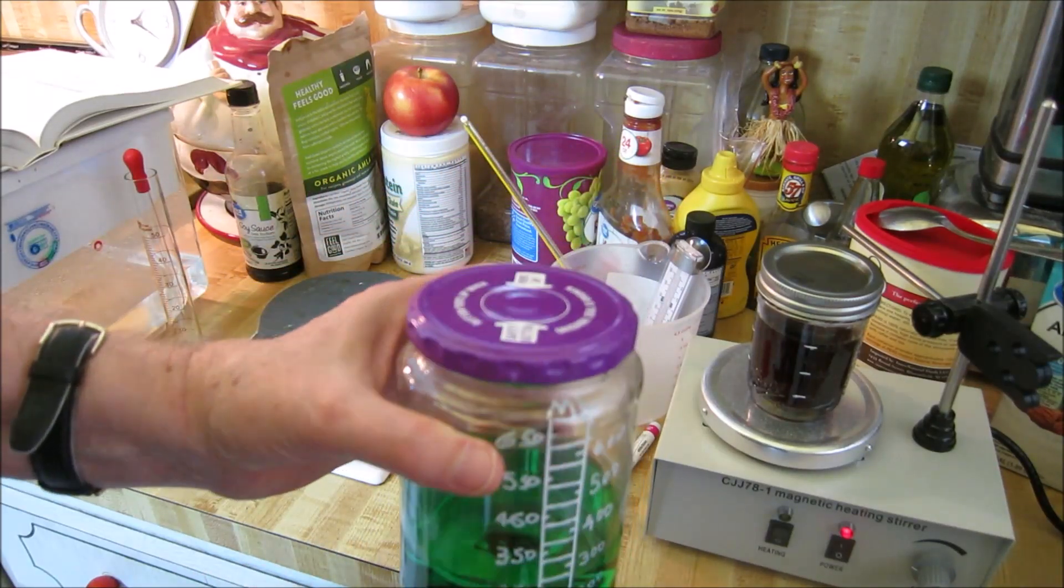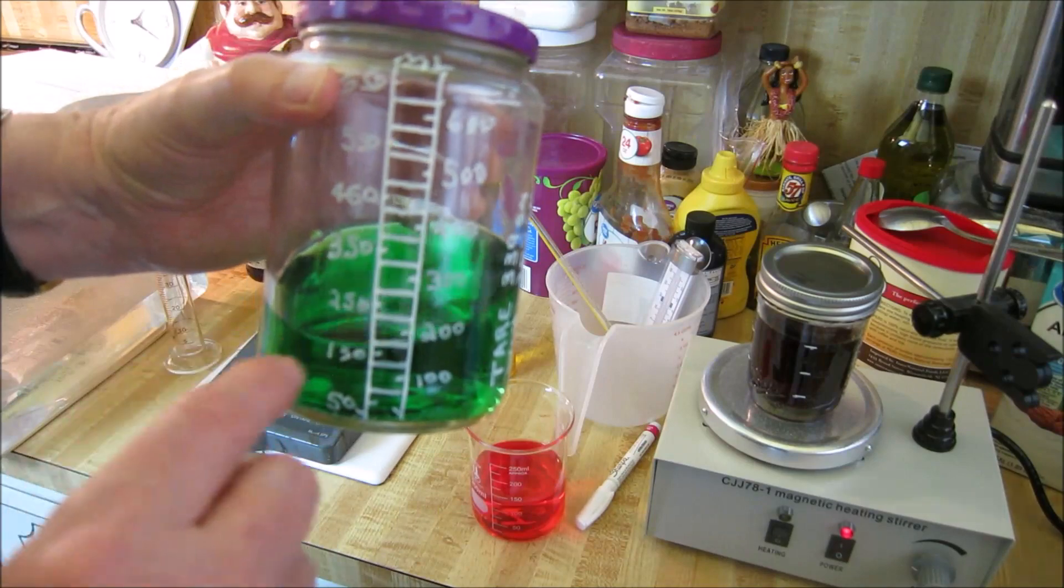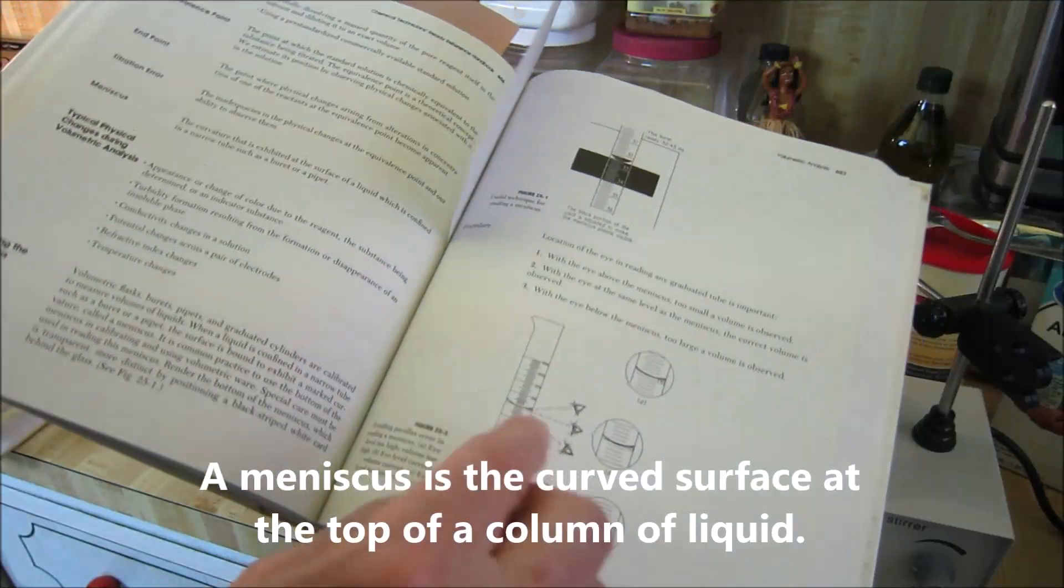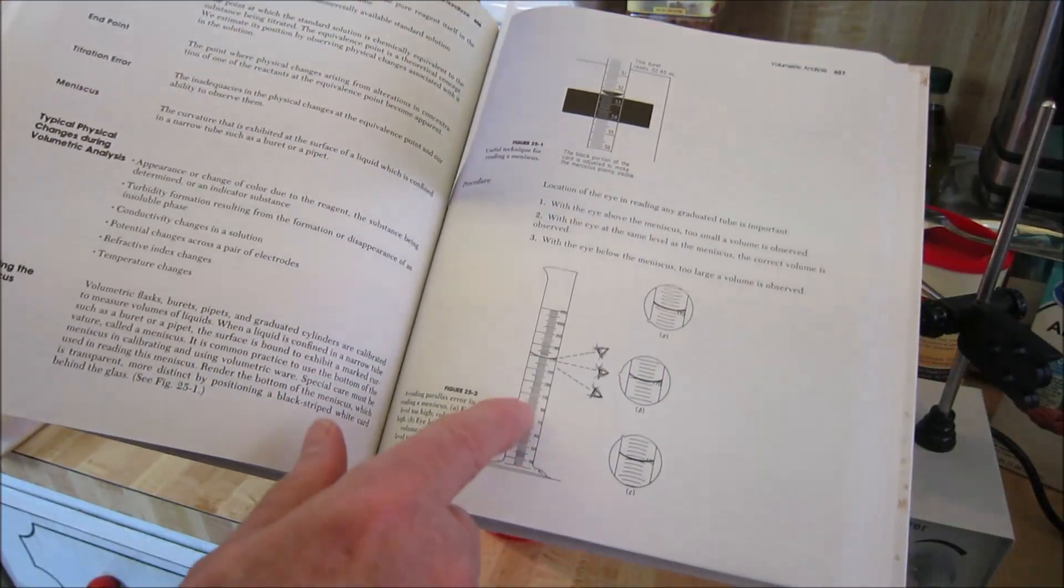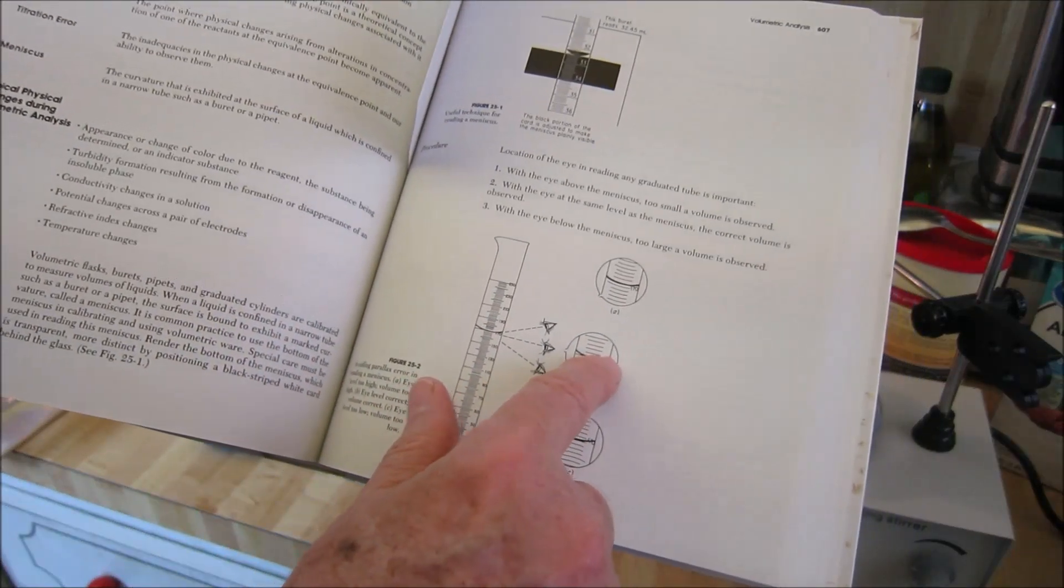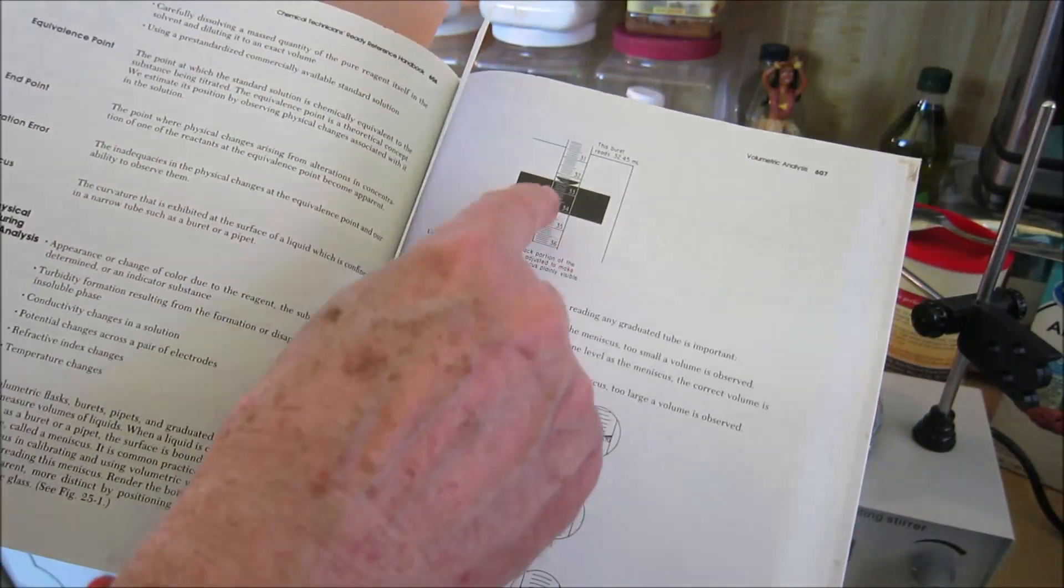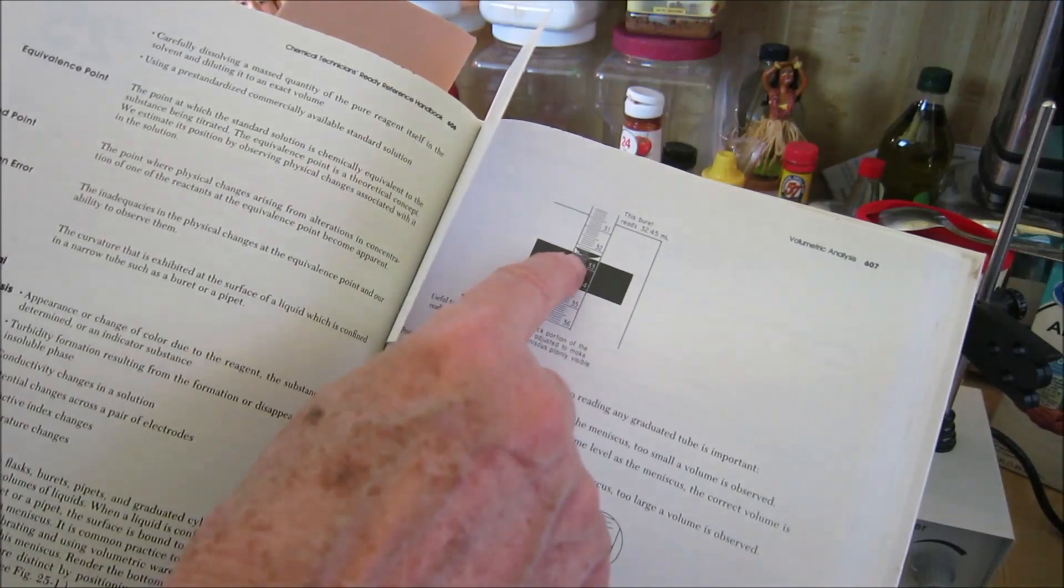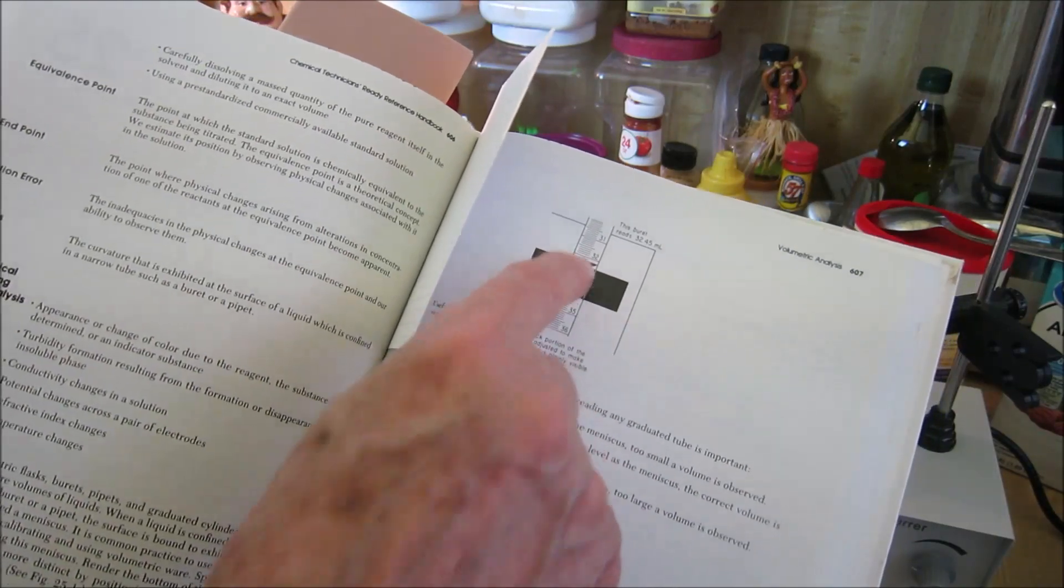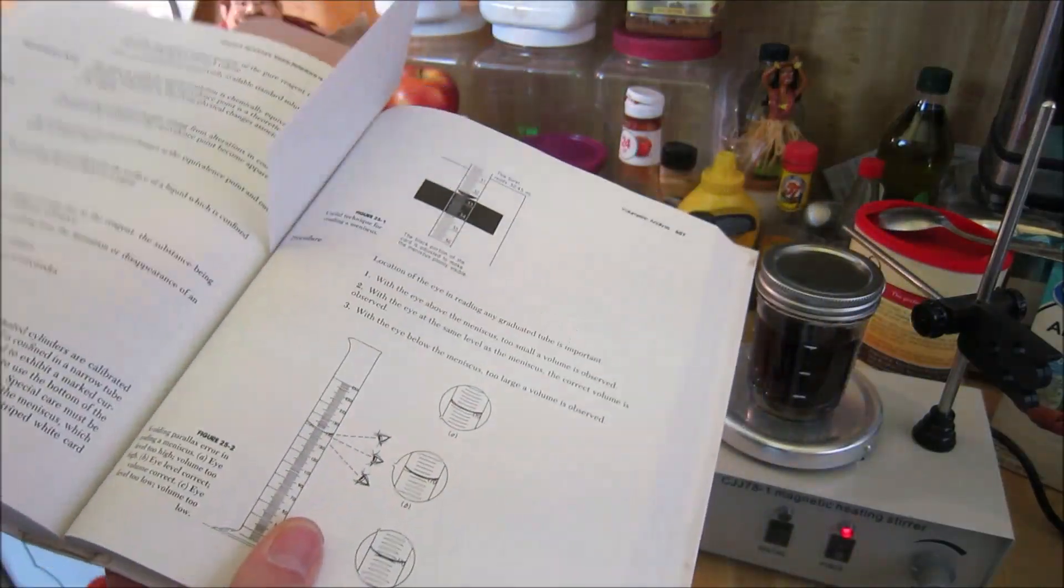And then the second thing I want to tell you about making your own volumetric containers is you want to make sure you use the meniscus. I got my lab book. When you measure stuff in the glassware, the liquid has a curvature to it. So you want to make sure that you're looking right below the curvature. The book says you can put a black card behind the glassware to see the curvature better. And where the measurement is measured at is right where that curvature, the meniscus, touches. Not above the curvature or in the middle or right below. That's your meniscus.